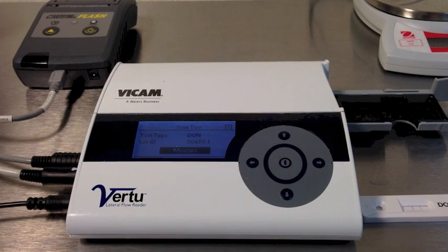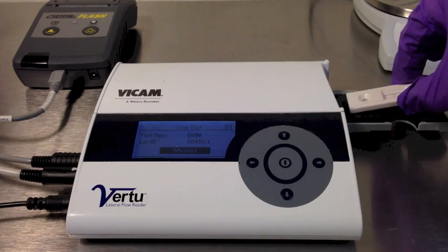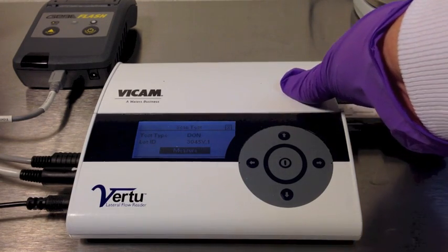Insert the Don V Strip Test into the Vertu Reader with the circular opening to the left. Press the Center Enter button to start the measurement.